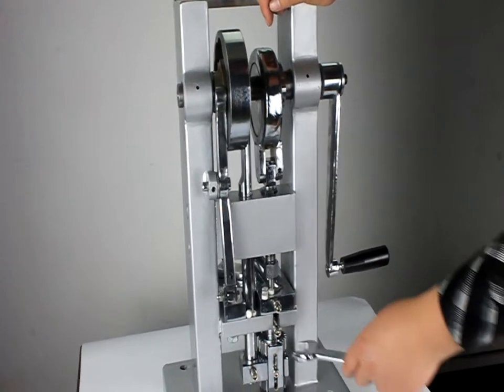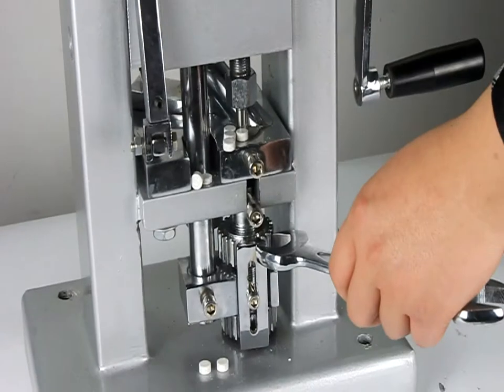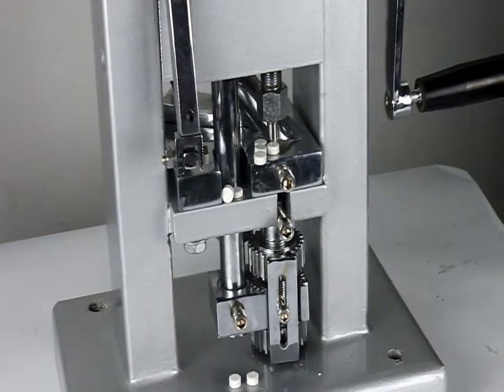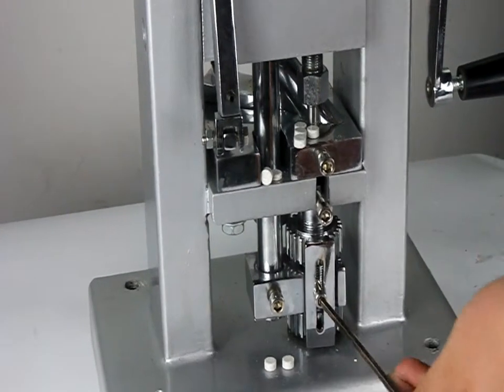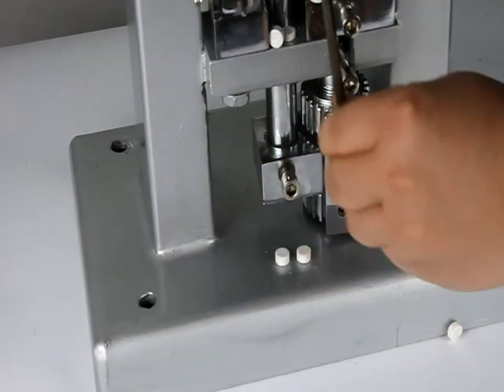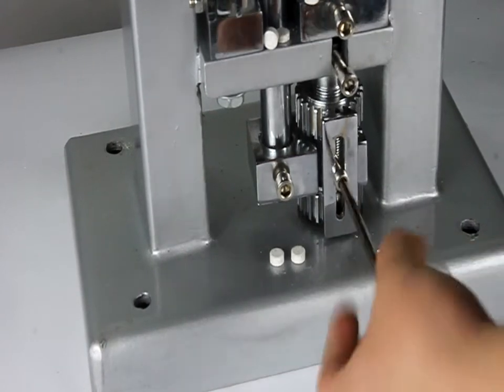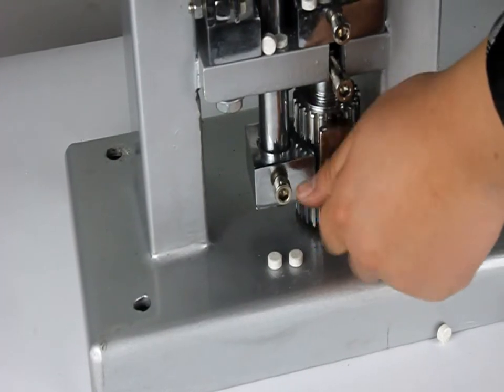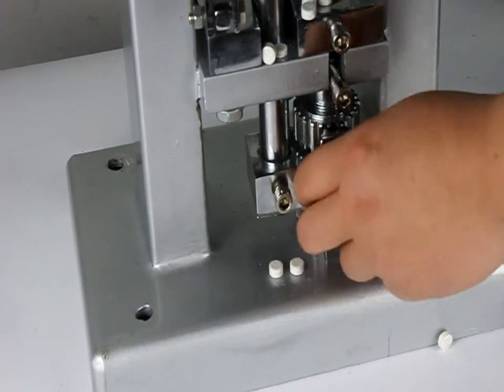On the bottom, this place is where you can adjust the tablet thickness — by loosening the scroll. Now you can adjust the thickness of the tablets here.